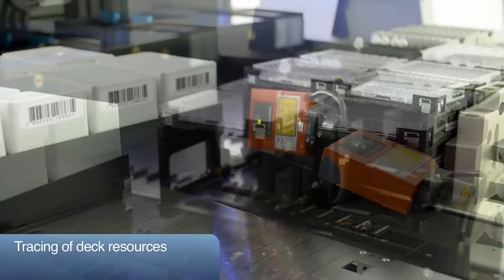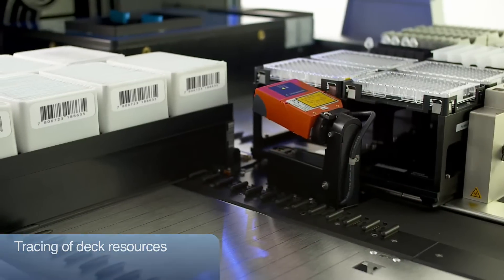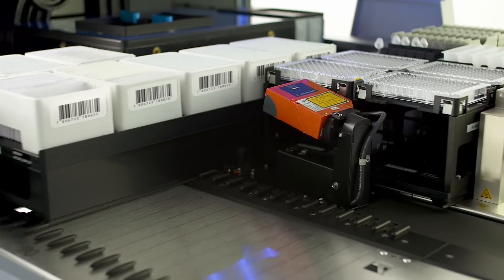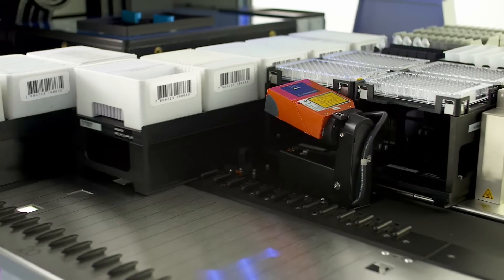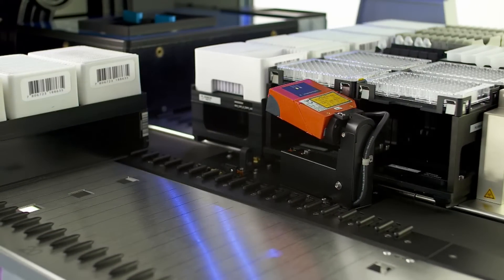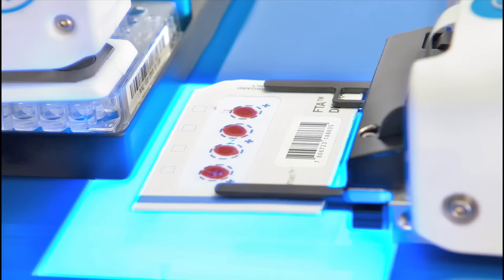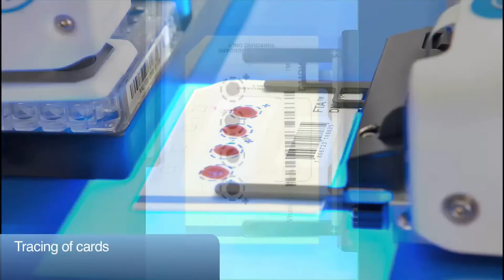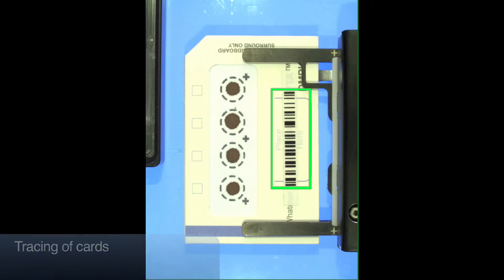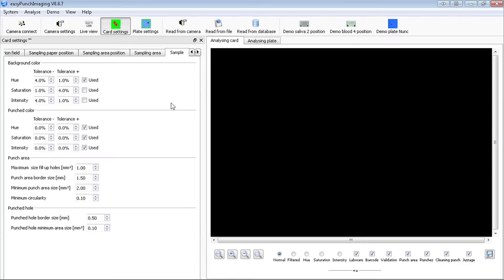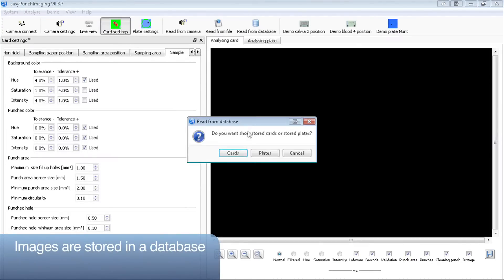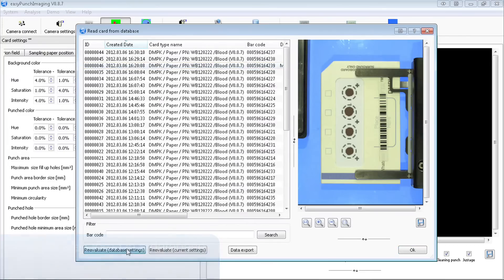During loading, all barcodes of magazines and plates are read and traced. In addition, EasyPunch traces every card and every sample punched out of this card. Before punching, the barcode of the card is decoded and a picture of the card is stored in a local database and can be re-evaluated if required.